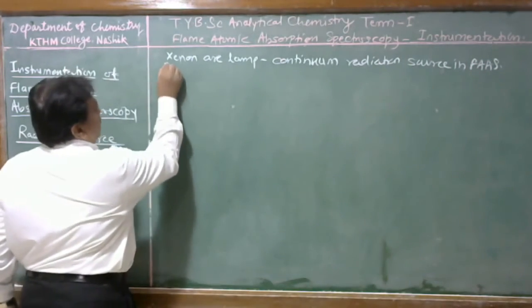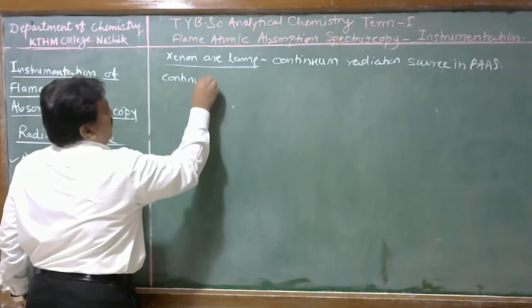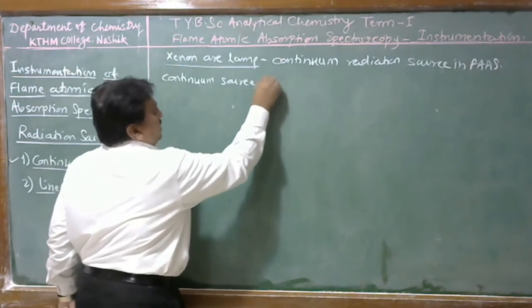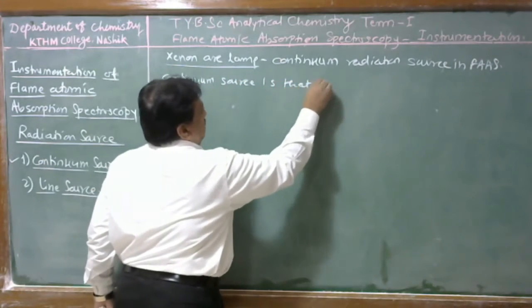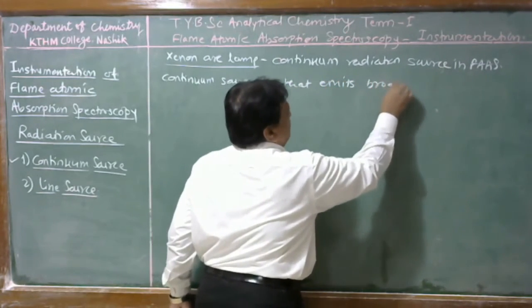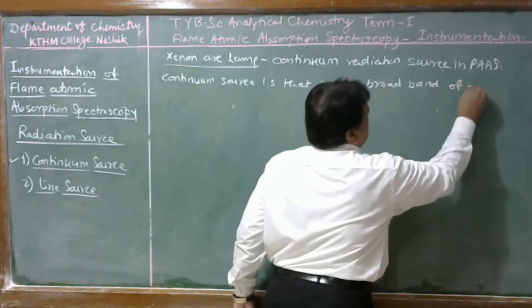A continuum source emits a broad band of radiations.